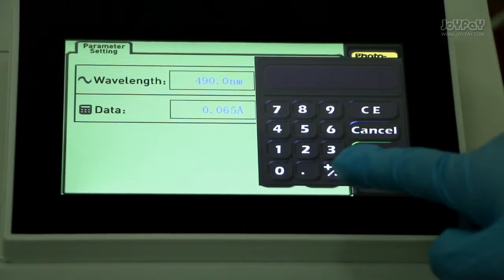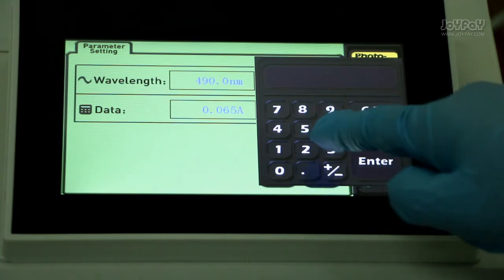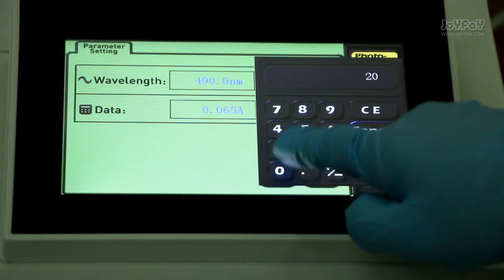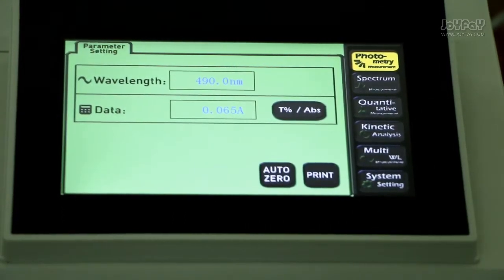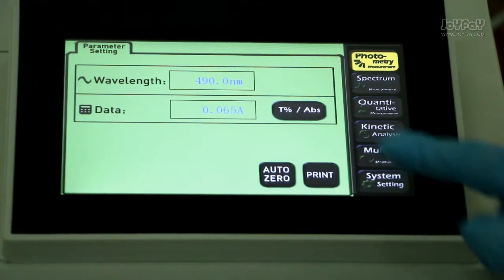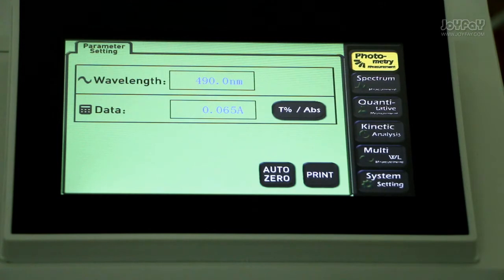The range of the machine is from 190 to 1100 nm. If the input value is not appropriate for the instrument parameter, the display will show out of range to indicate wrong input. Then input a correct value.